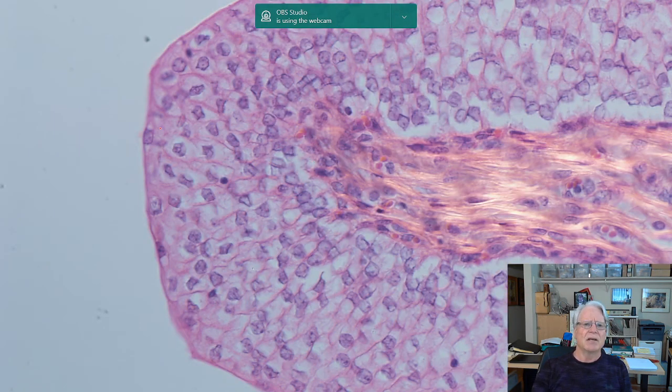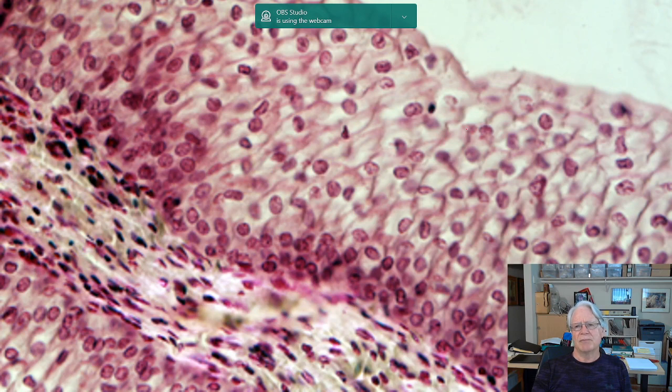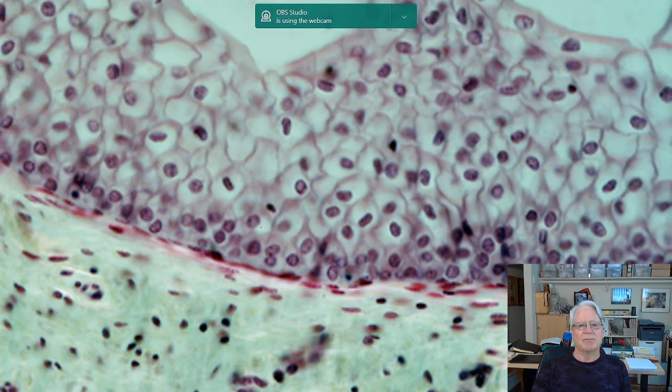Okay, same thing. They get larger up here and smaller down here. Okay. This is connective tissue here. Same pattern, larger up here, smaller. And the nuclei are more densely packed down here because the cells are smaller. So the nuclei are closer together. Out here, because the cells are bigger, they're more spread out. Same thing, a lot of cells down here, a lot of nuclei here. This is the basal surface here, and this is the apical surface. Notice how much larger they are here. The nuclei are spread out from each other, and they're not so densely packed together. Here they are, fairly densely packed together.